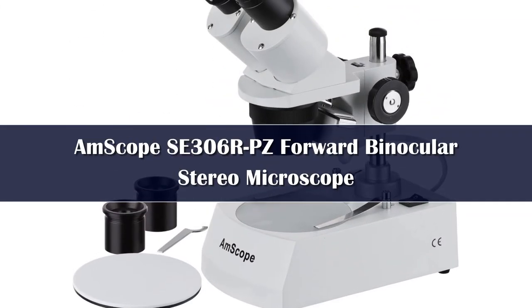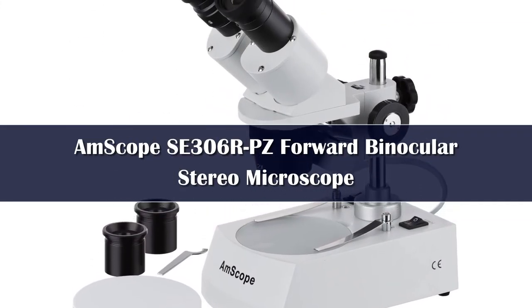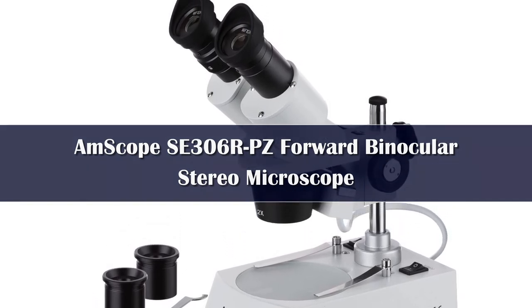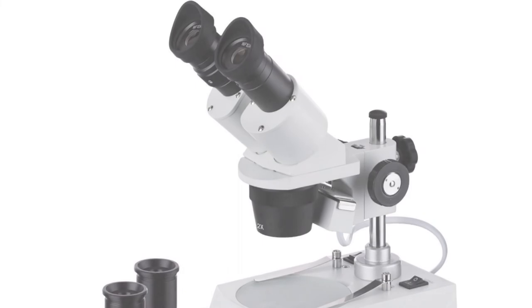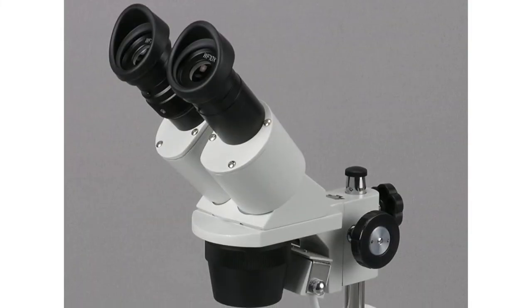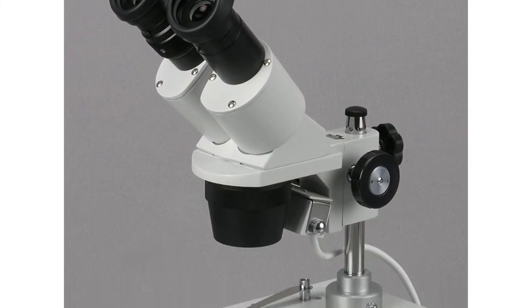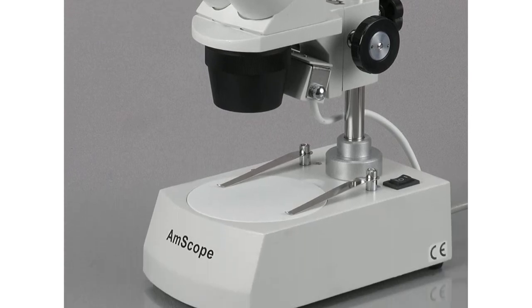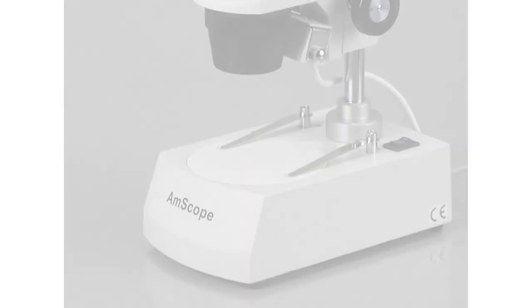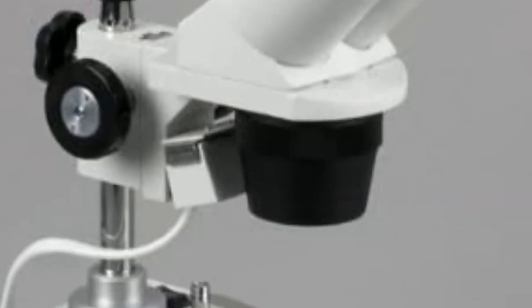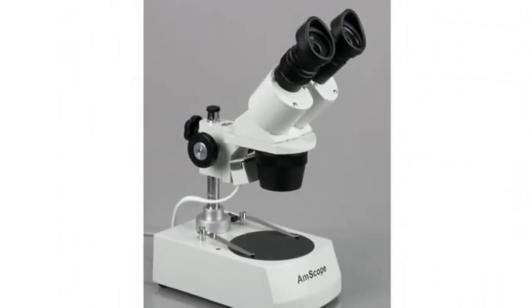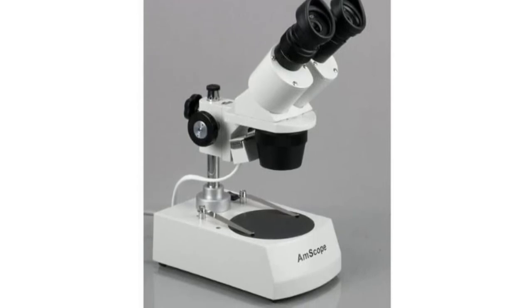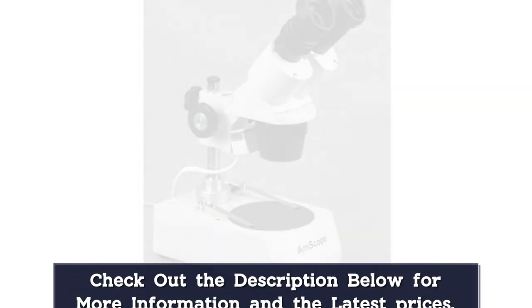Number 2. Here we have a smaller model from Amscope. Cheap stereo microscopes like this one are ideal for at home science experiments. If you have a little one that loves to investigate the world around them, this device will be an excellent gift. Although this microscope size is relatively small, it can magnify up to 80 times to get into the smallest nooks and crannies of your subjects. Best of all, this microscope comes with rubber eye guards so that you don't have to hover over the lenses to see anything.